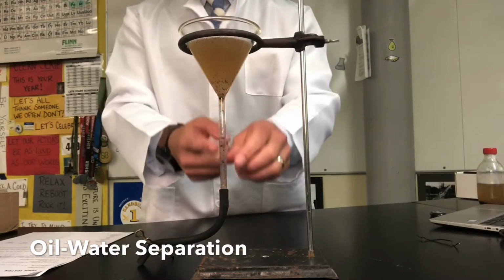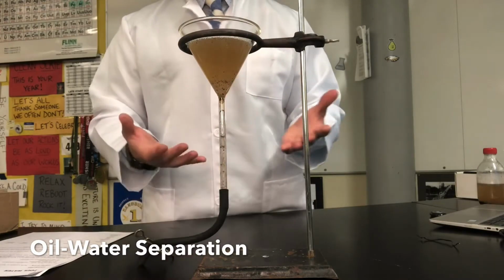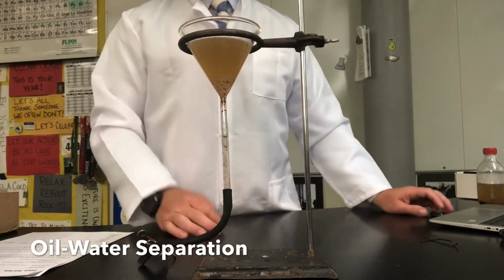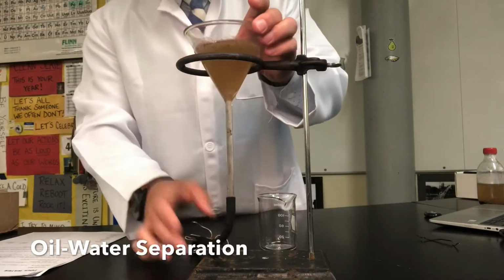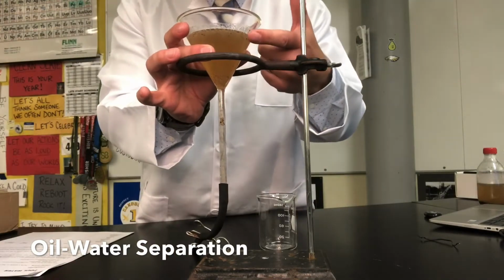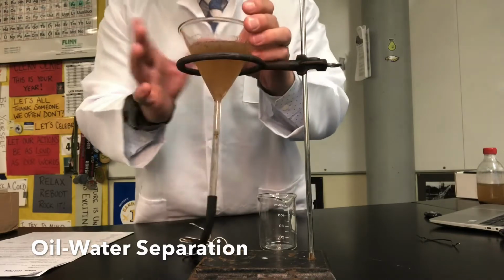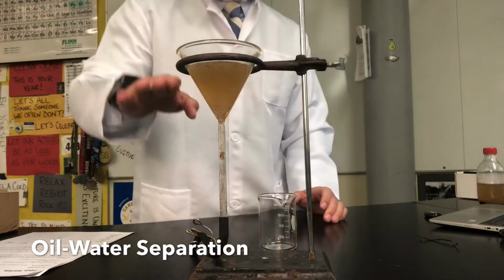I'll then be able to let out the water from the bottom and keep the oil behind. That's the goal. So we're going to give this a few minutes to set up and sit so we can try to separate these as best as possible. All right, we're back, and now that we've let this set up, it's probably hard to see from here, but at the very top there's a thin layer of oil and bubble globules of oil, and underneath is still the dirty water. Now, by no means is this water clean, but we now have taken advantage of the oil rising to the top.